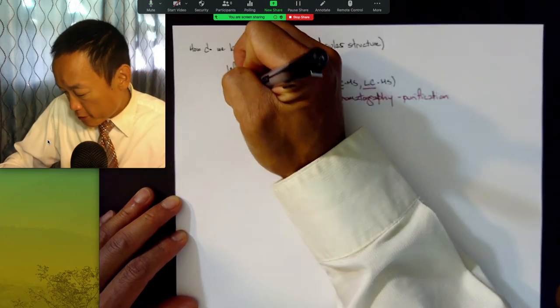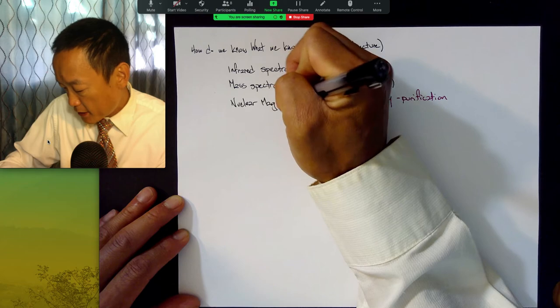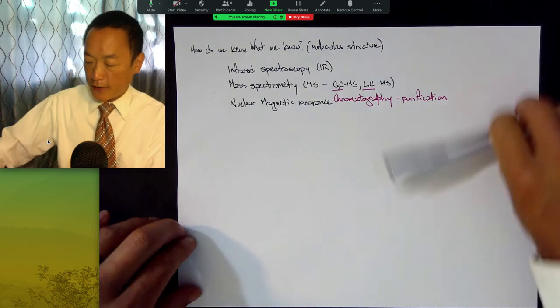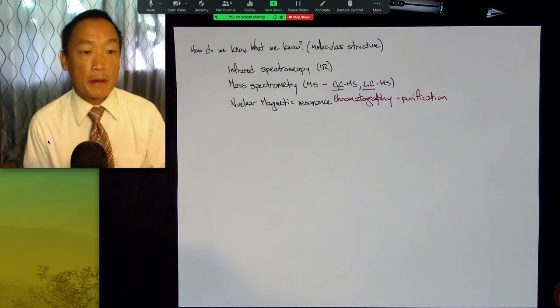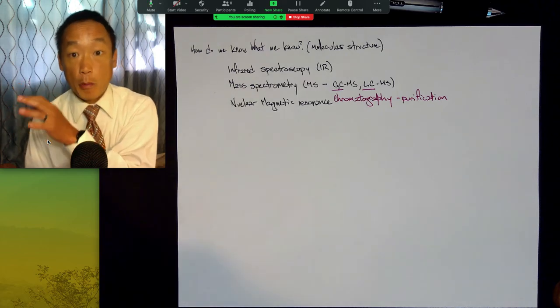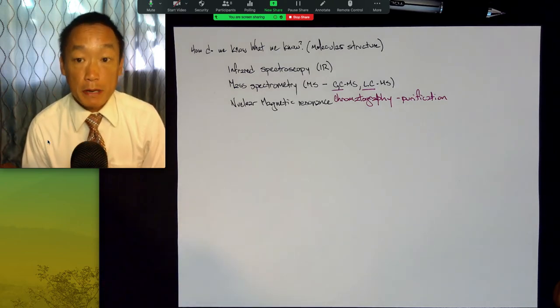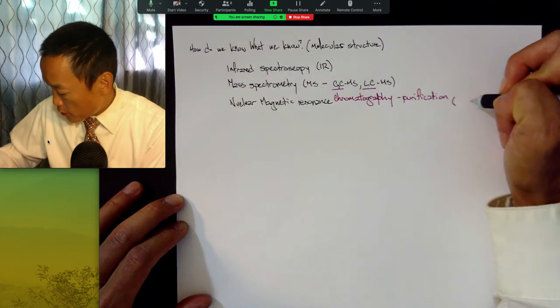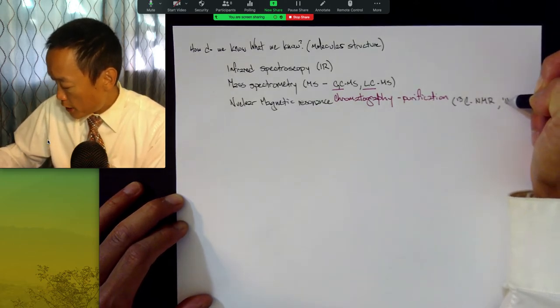And then the other one that we'll start talking about tomorrow is nuclear magnetic resonance. And that is some powerful, powerful stuff. And you've already been introduced to this stuff, but we're going to be going back into what is the instrumentation, how does the instrumentation work, how does it produce the chromatogram or spectrum that you're looking at, and then moving forward from that, how do you actually analyze that spectrum to move forward. And so these are the techniques, and I'll just write here. We'll be looking at 13C NMR, and we'll also be looking at proton NMR.